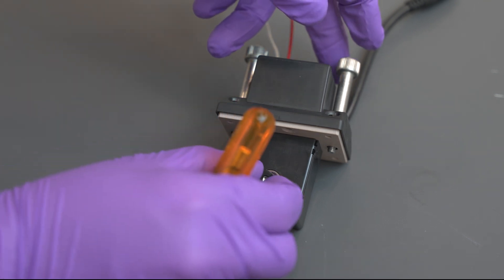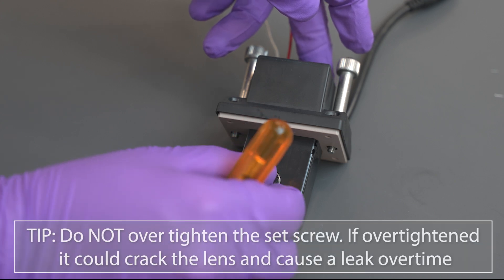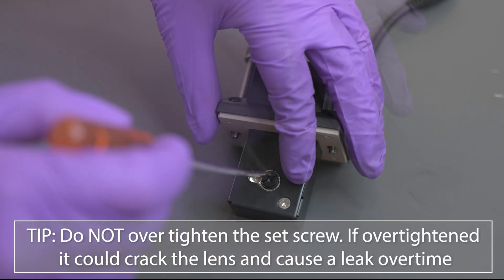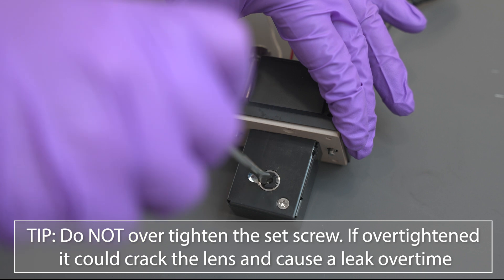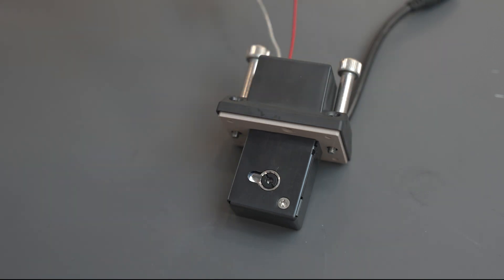Attach the set screw over the lens and tighten it. Do not over tighten the set screw. If over tightened, it could crack the lens and cause a leak over time. Repeat this step for the other side.